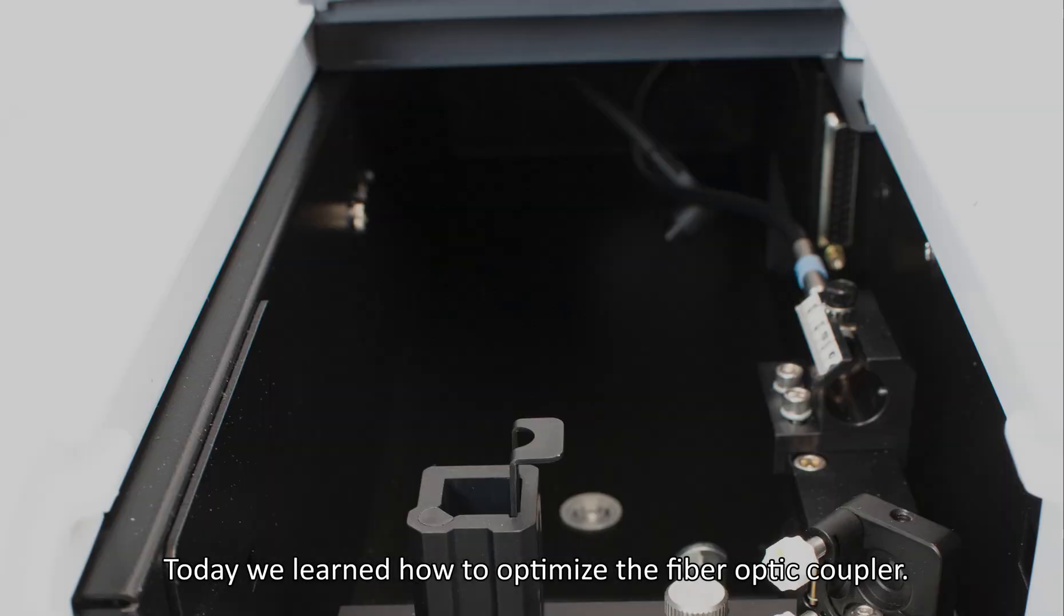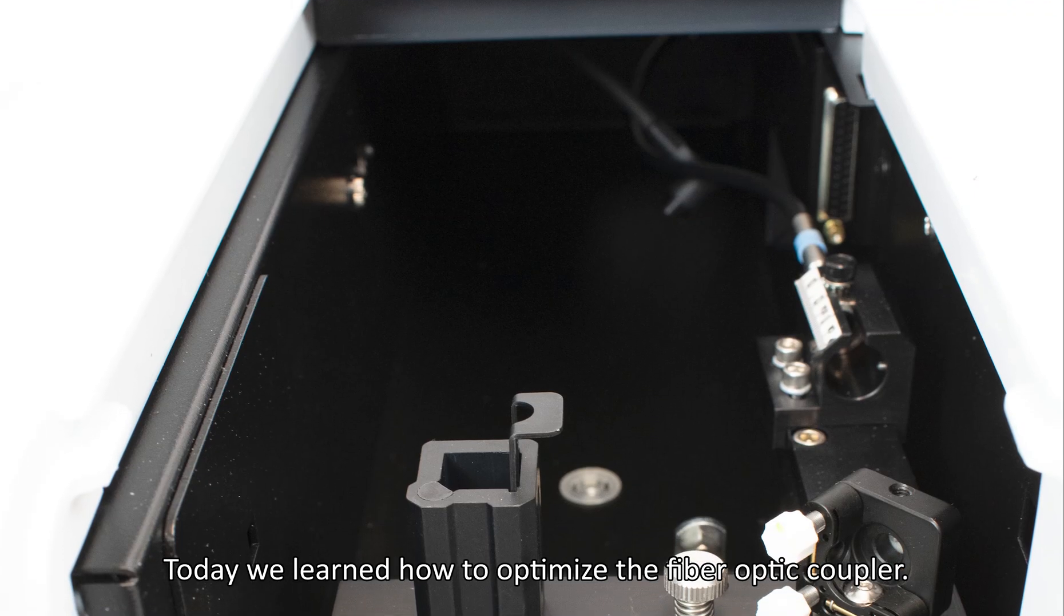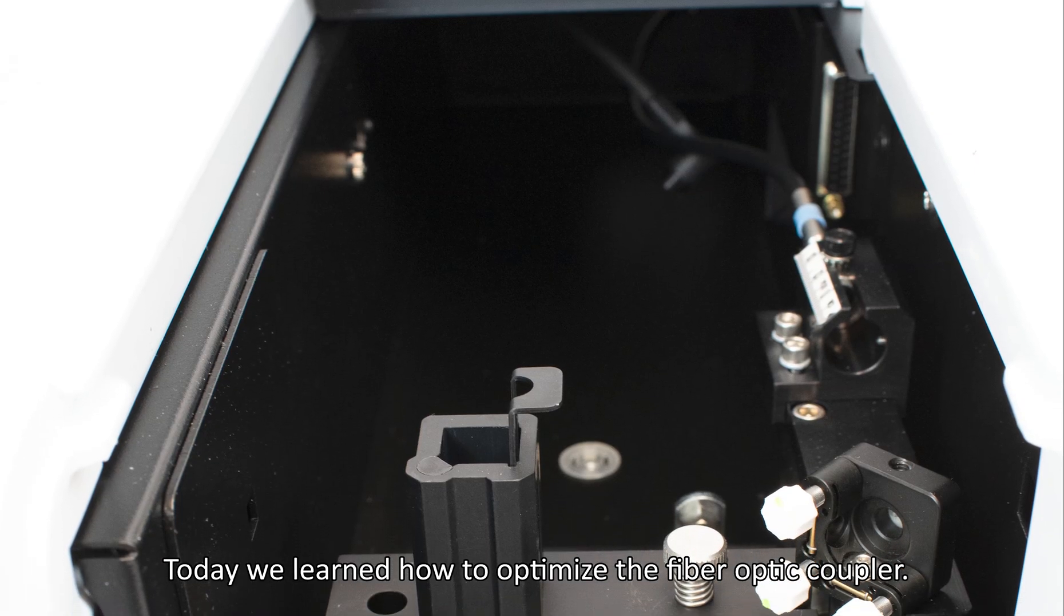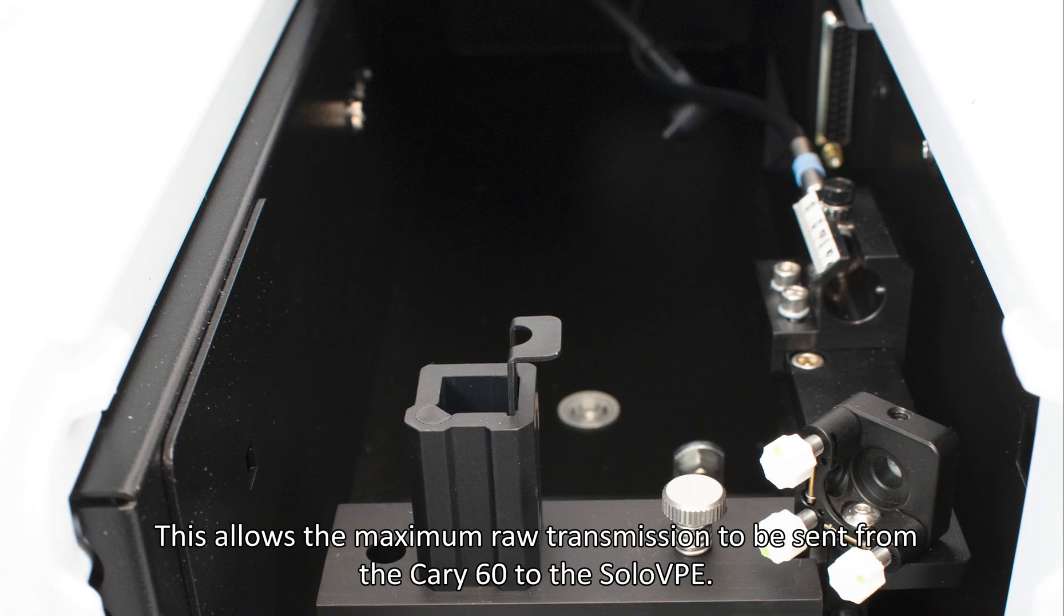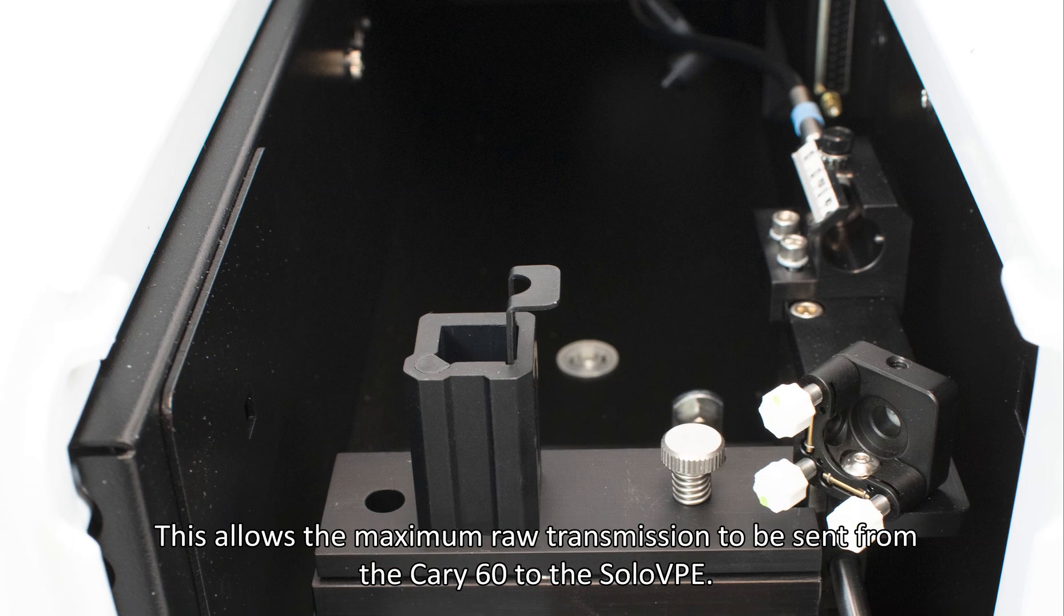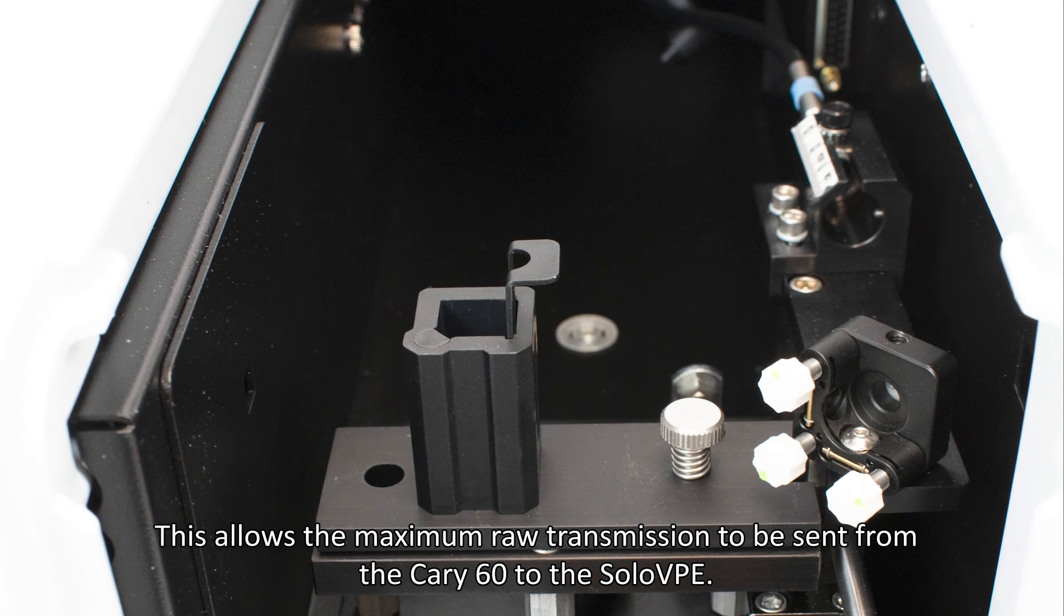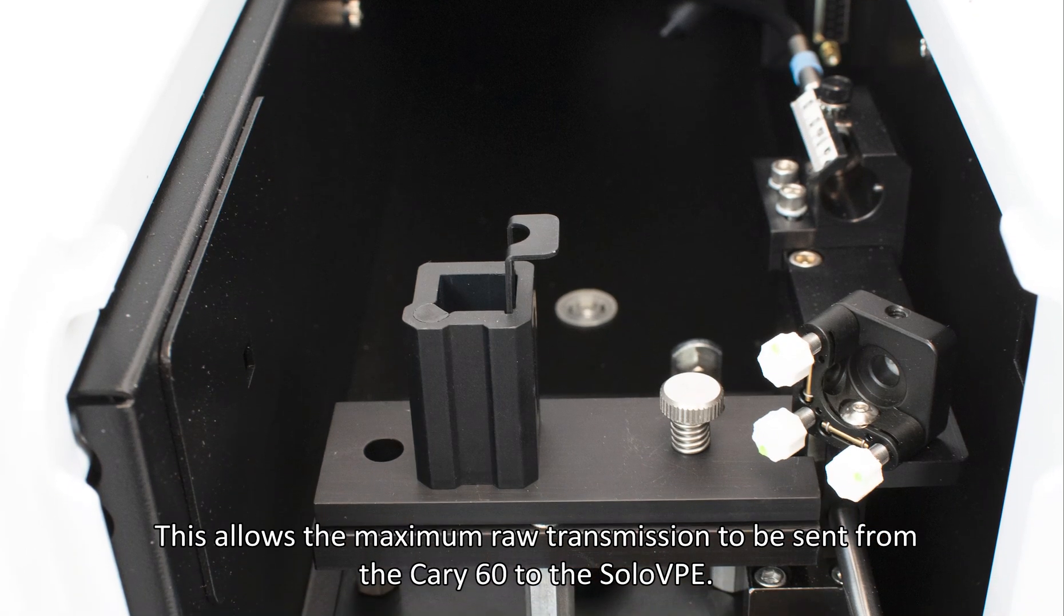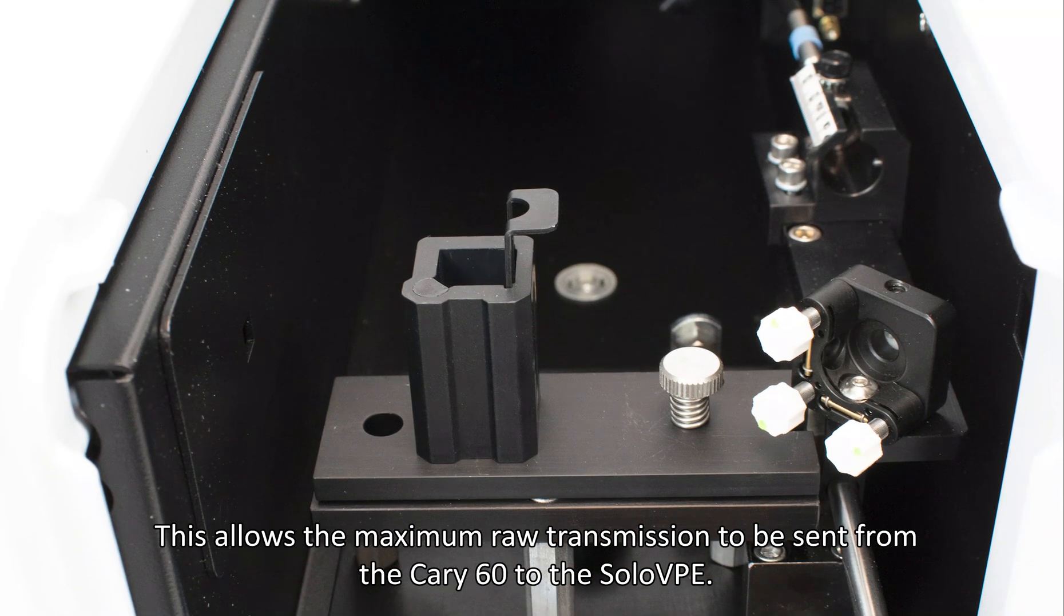Today we learned how to optimize the coupler. This allows the maximum raw transmission to be sent from the Cary 60 to the SoloVPE.